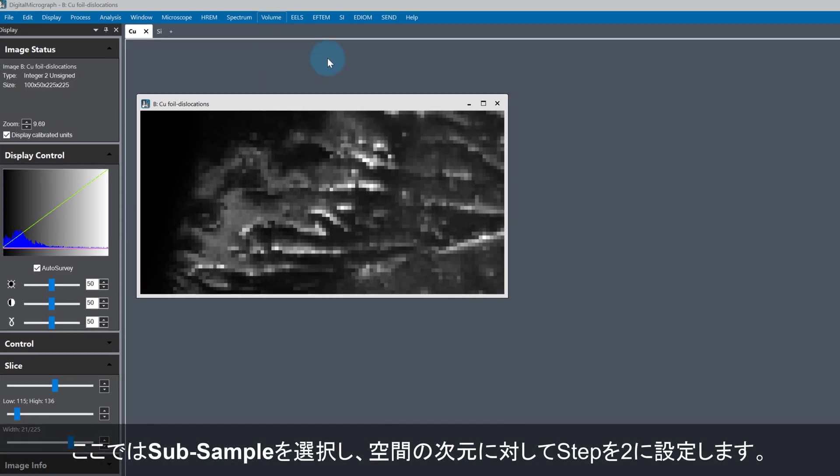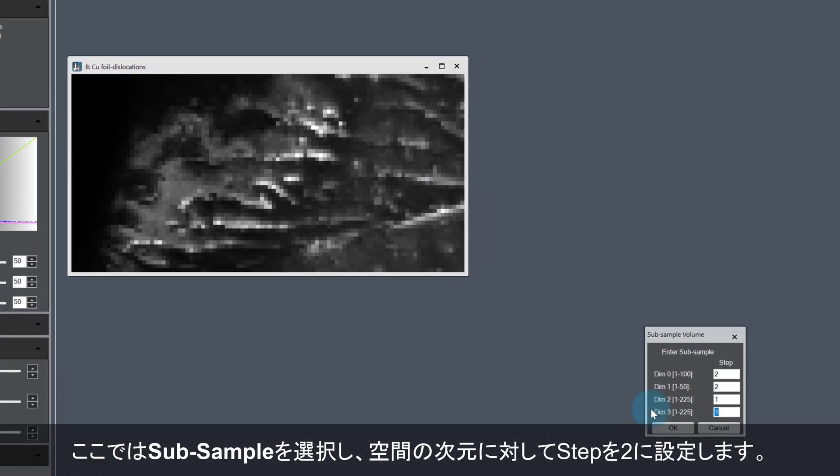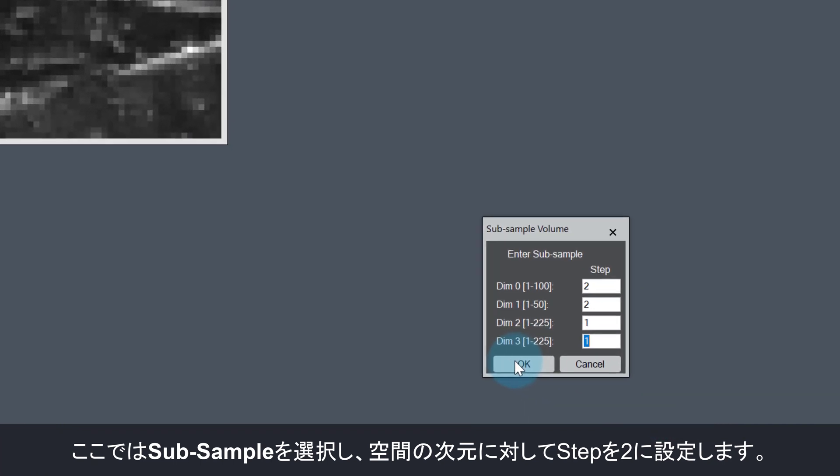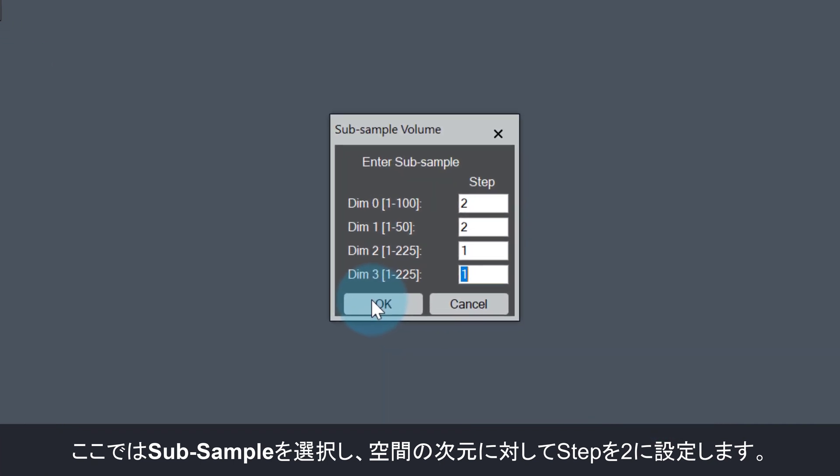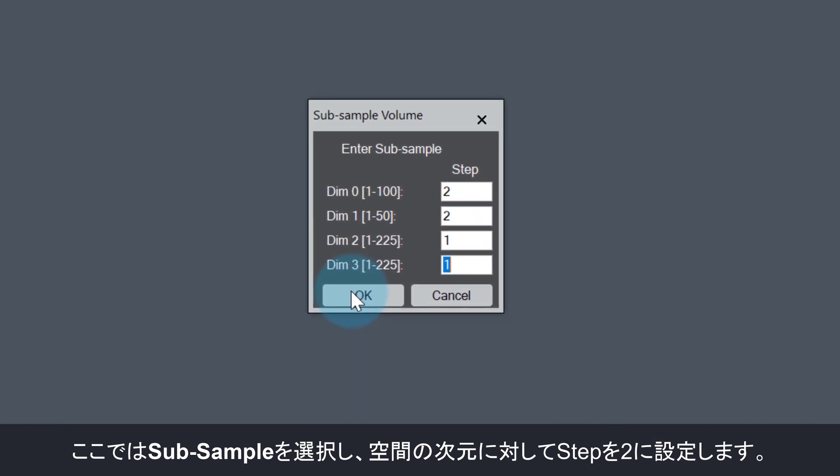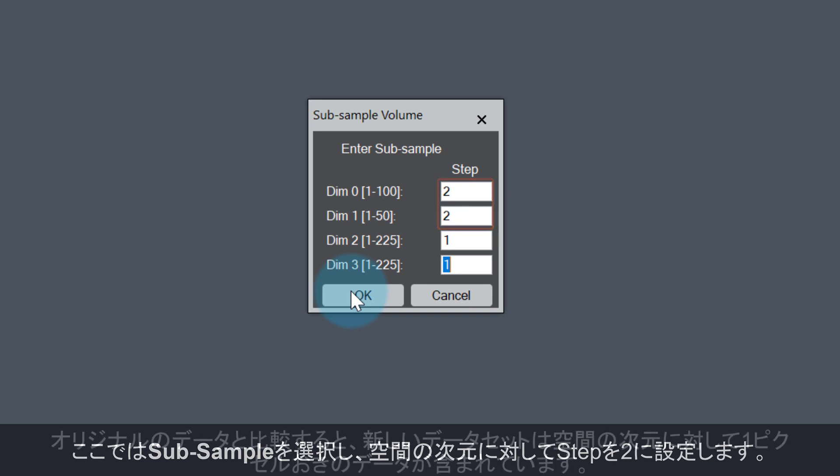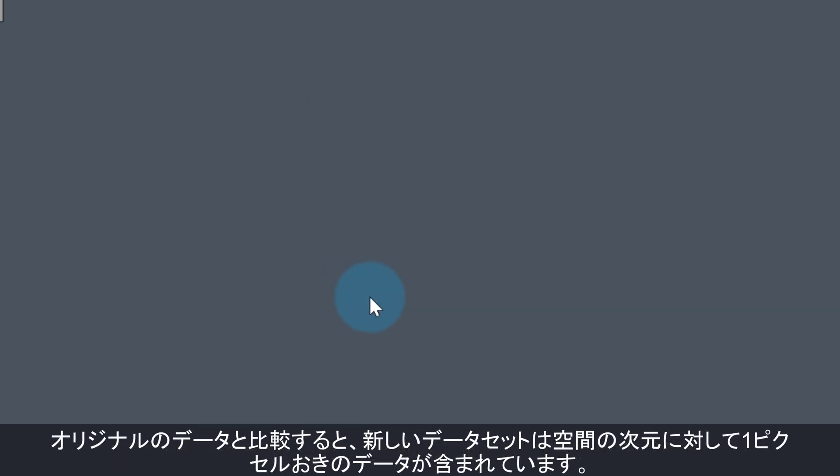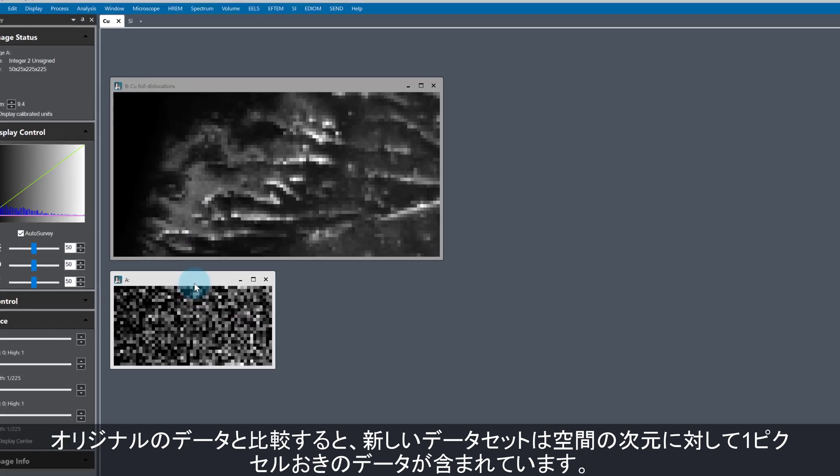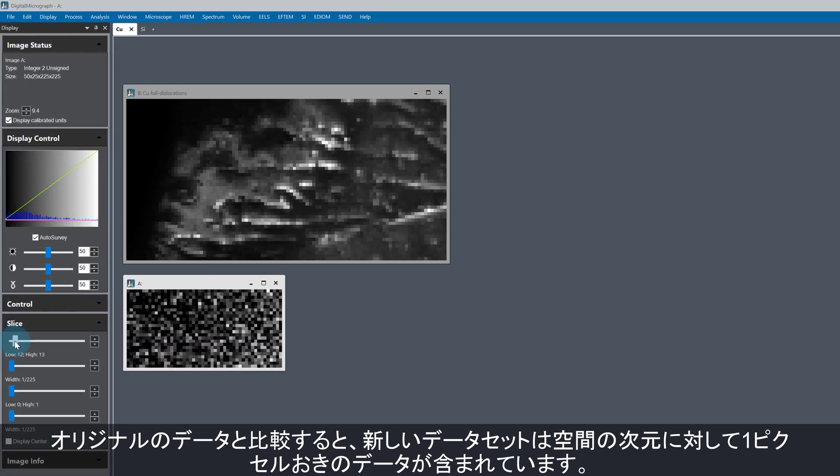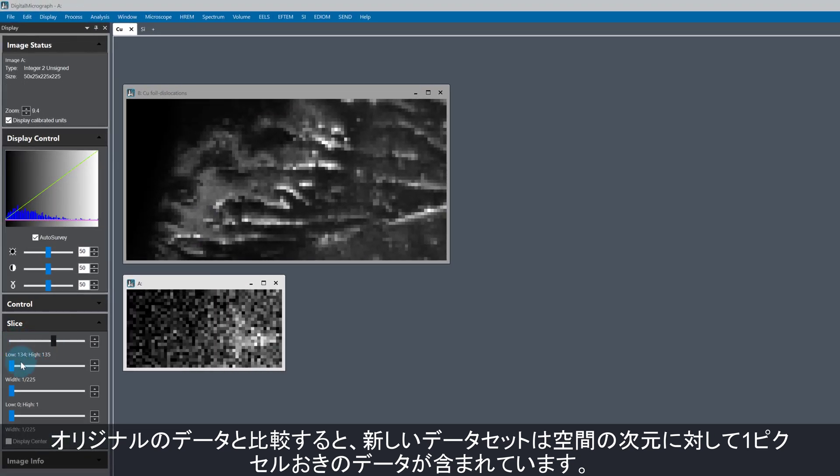As an example, I'm going to select Sub-sampling, and only sub-sample in the real space dimensions. I am choosing 2 as the step size, which means the new dataset will have every other pixel in the spatial dimensions of the original data.